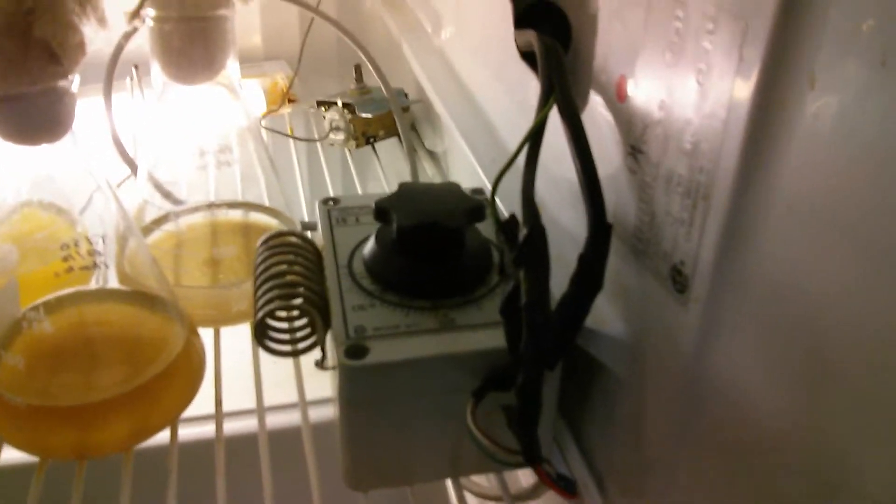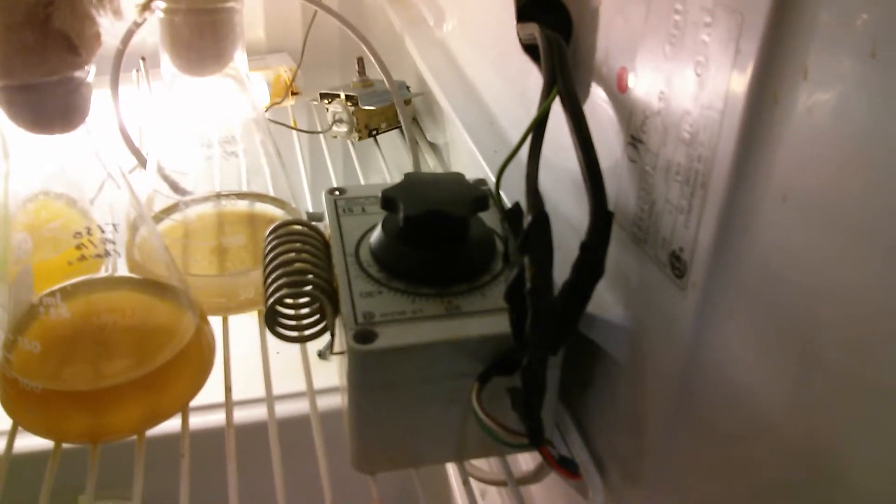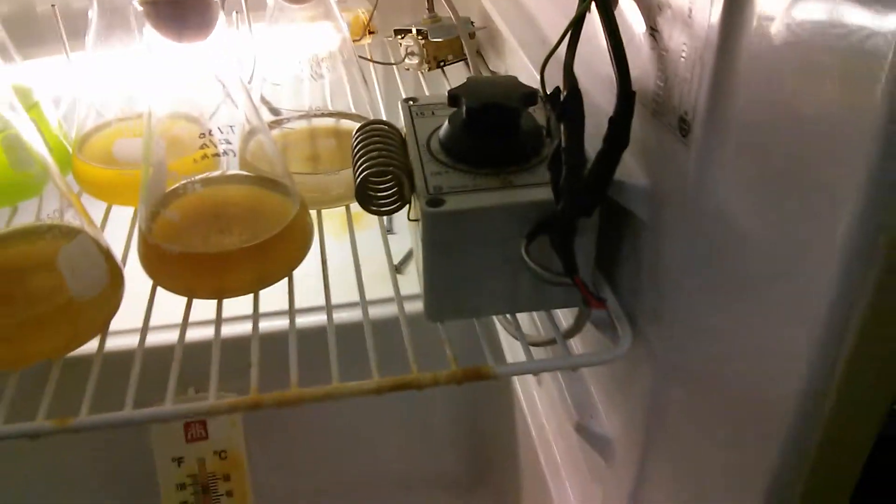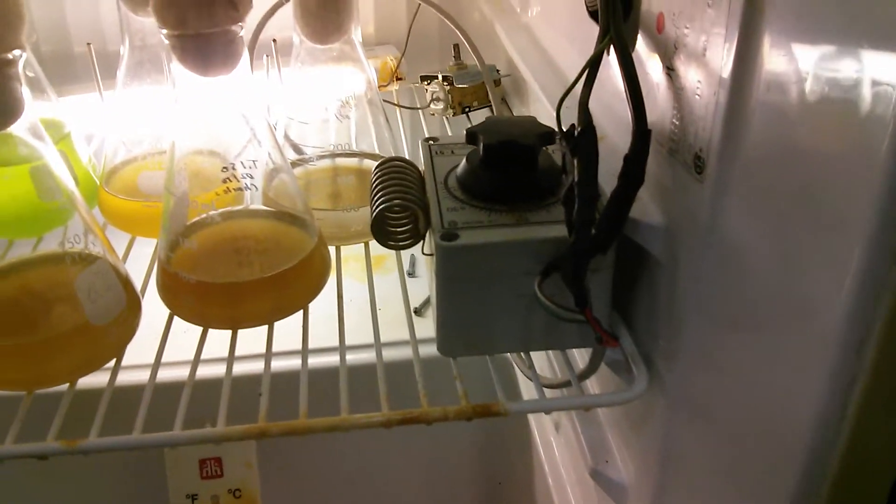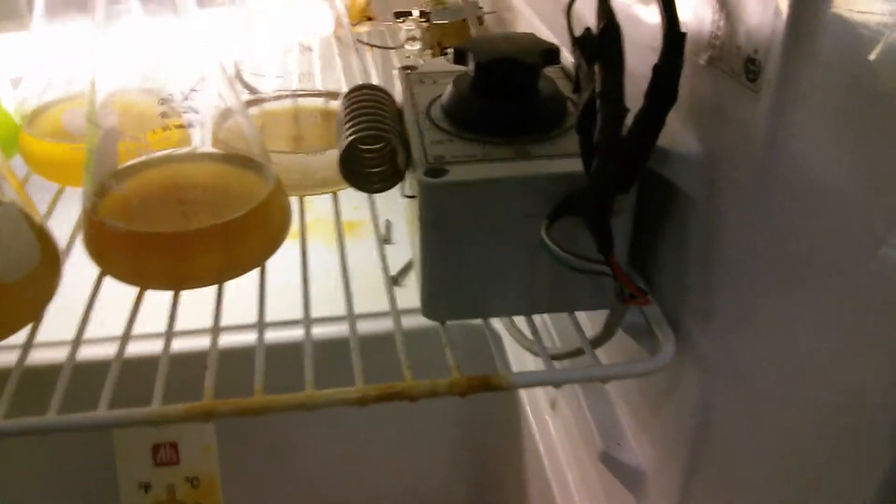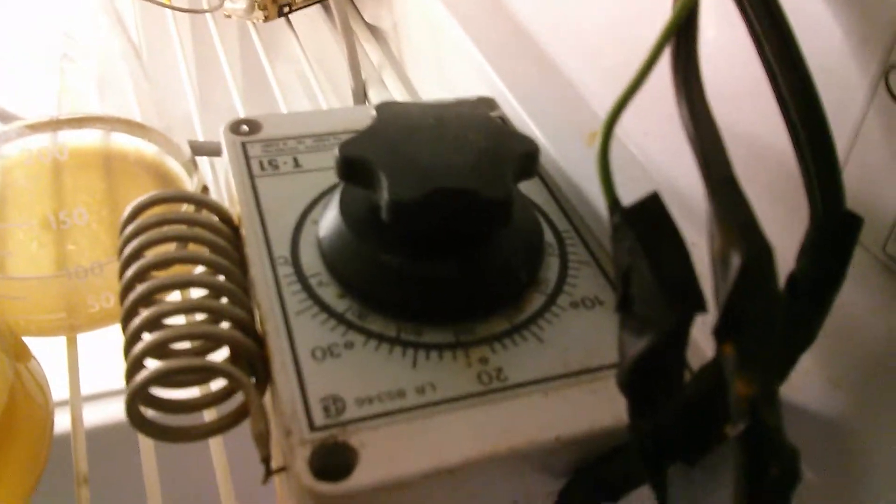A little control box there that you use to control the temperature from a refrigerator into the range that you want for a growth chamber. You can see that one there where it's set.